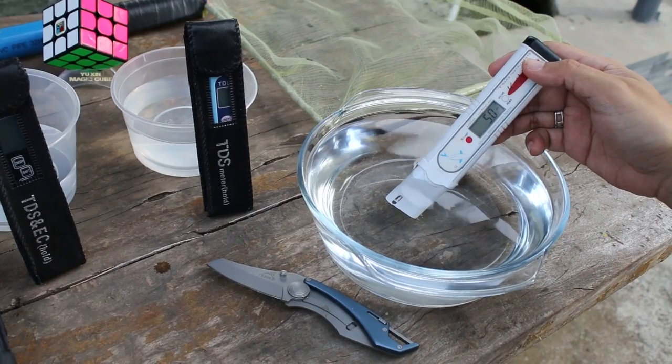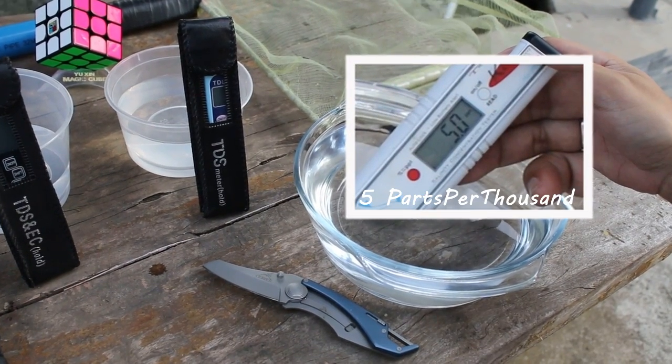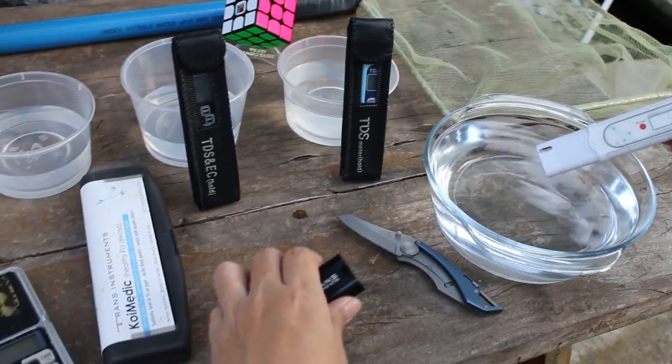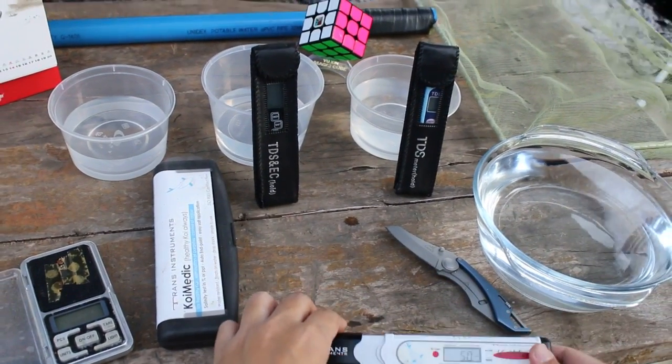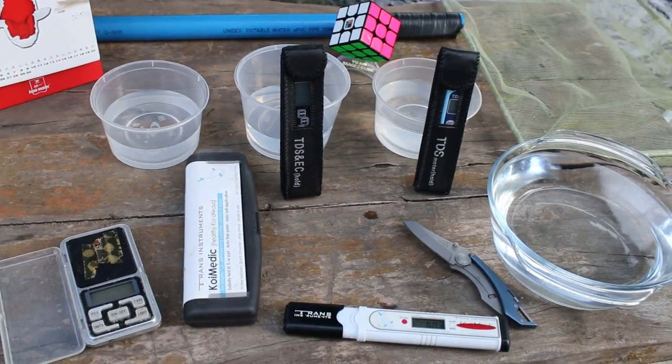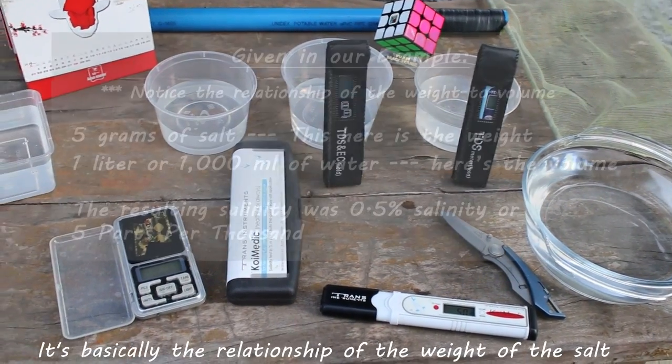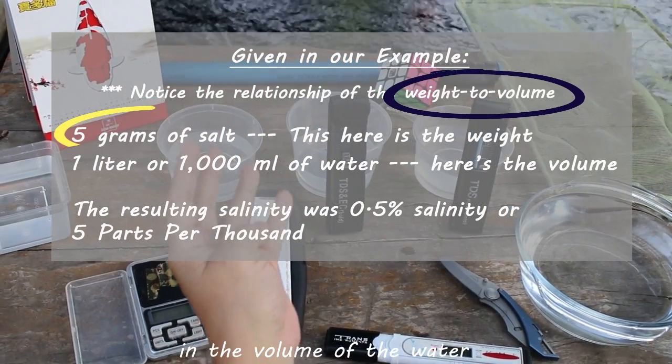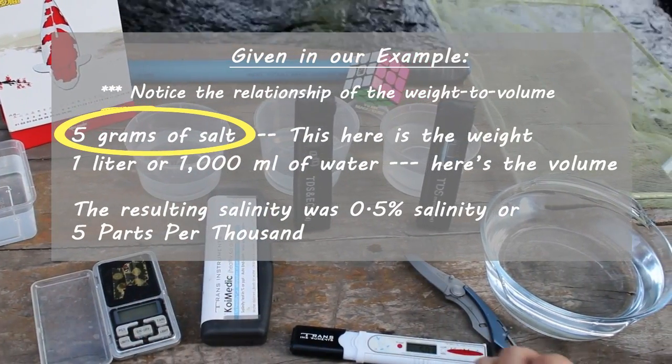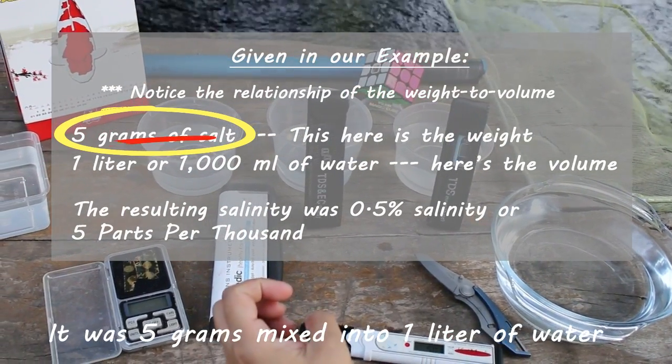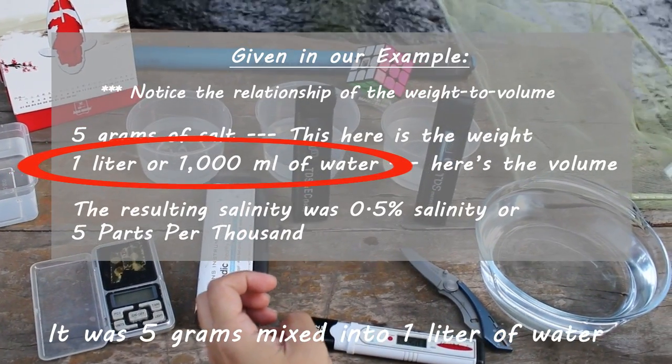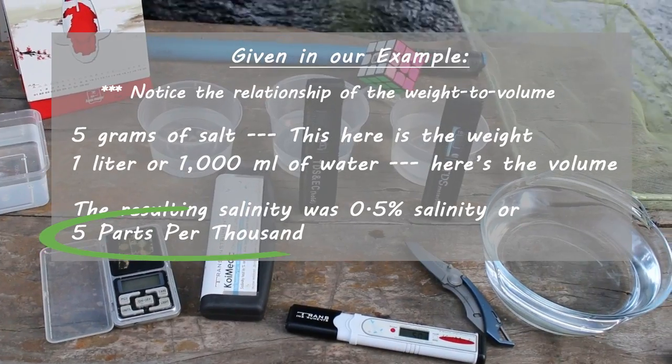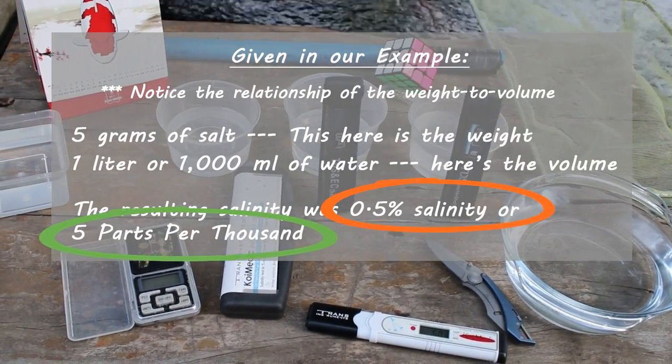So I hope this demonstration showed you a little bit of the basics of salt and water salinity. It's basically the relationship of the weight of the salt to the volume of the water. In our example, it was five grams mixed into one liter of water. The resulting salinity was five parts per thousand or 0.5% salinity.